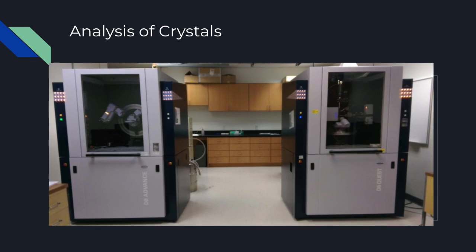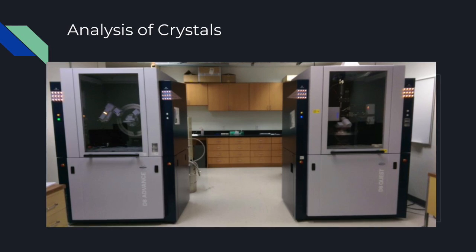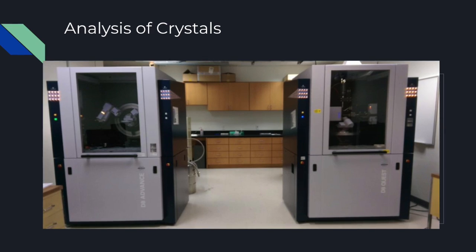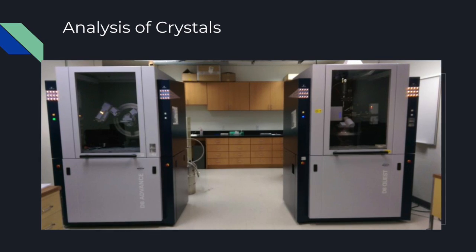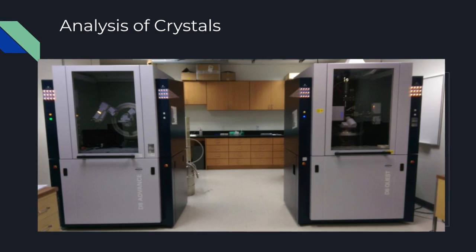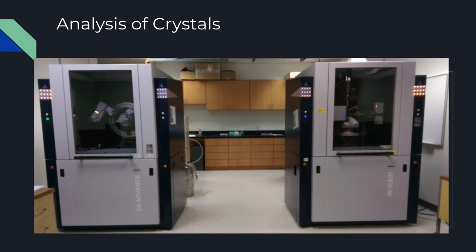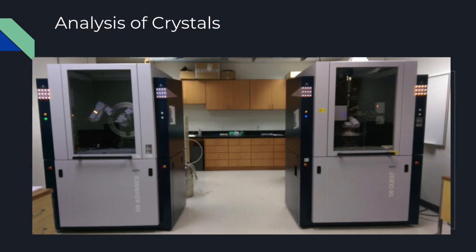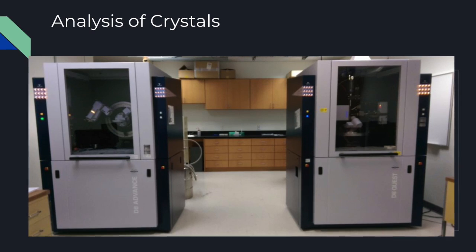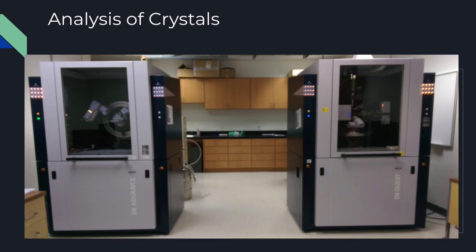To elaborate, first, before complex analysis is done, one must run powder diffraction on the crystals formed. This is where one crushes a sample of the crystals into a powder and puts it in an instrument that determines all the diffraction directions of the lattice. These diffractions are converted into a graph that shows peaks of max constructive interference. This graph can be cross-referenced with graphs in a database in order to determine what one has formed in the experiment. If a desired crystal phase was formed in the experiment, one can move on to single crystal diffraction.